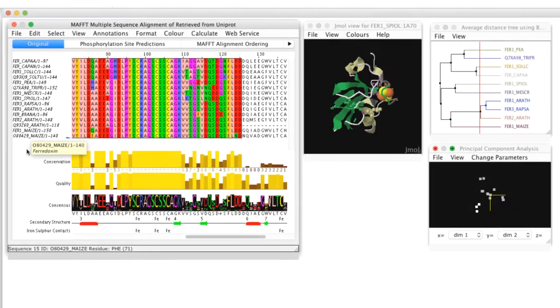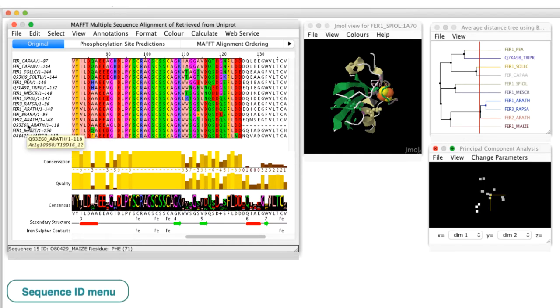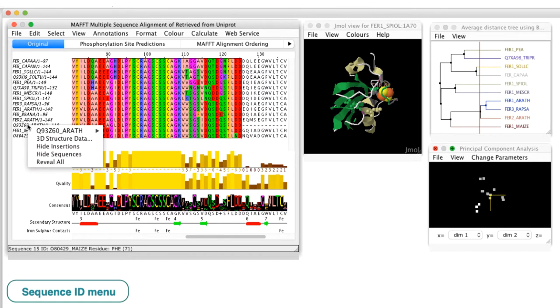For example, I open the sequence ID context menu by placing the cursor on the sequence ID panel and then click the right mouse button.